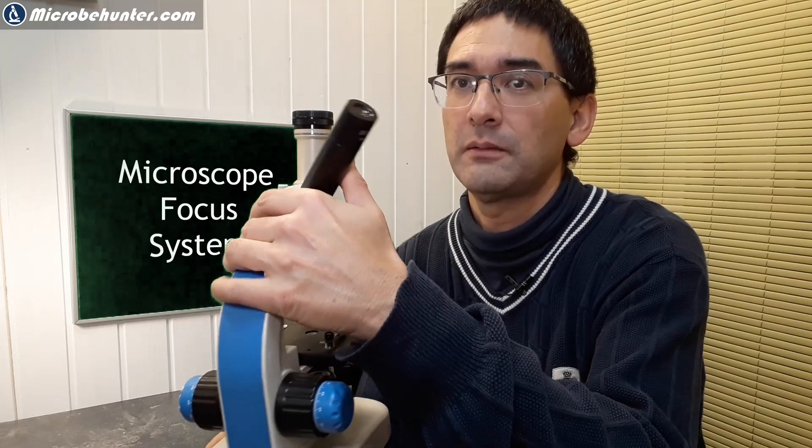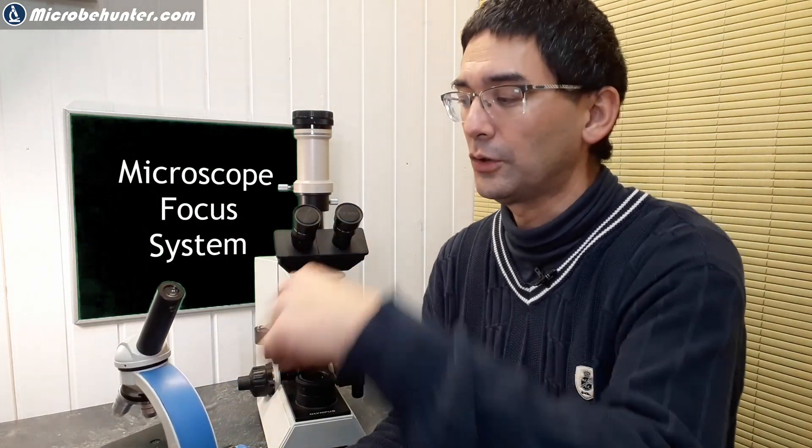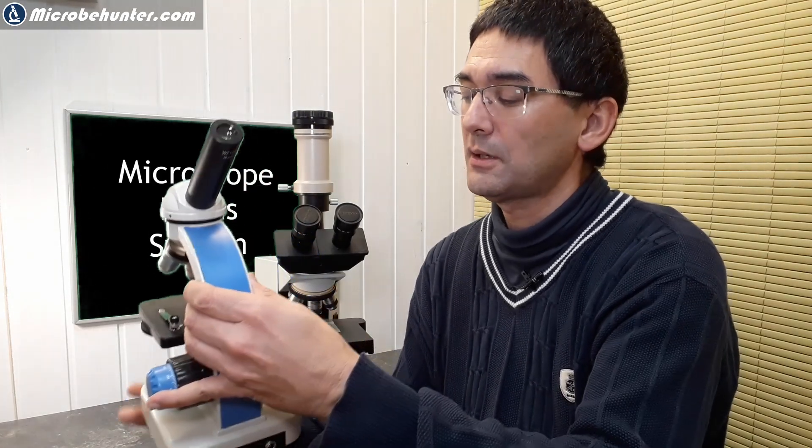Another thing is that on some microscopes the tube can be turned around, so if you want you can use the microscope the other way. This is more common with smaller microscopes — with larger ones you don't really turn the tube around — but at least you have the possibility, and this means you don't gain anything by only having a focusing knob on one side.